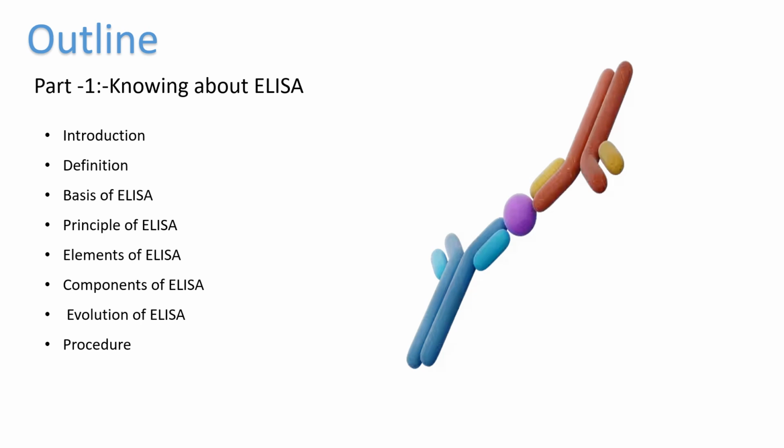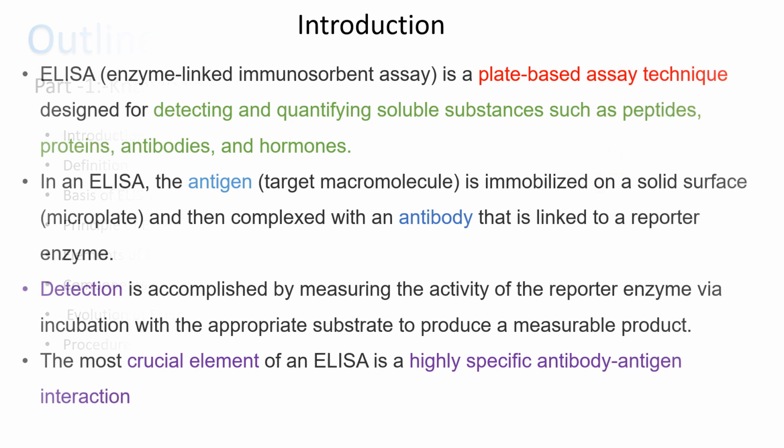In this series of topics, today we will be discussing ELISA: its definition, what the basis of ELISA is, on which principle it works, its elements and components, how it evolved, and what the general procedure in ELISA is. So first one is the introduction.